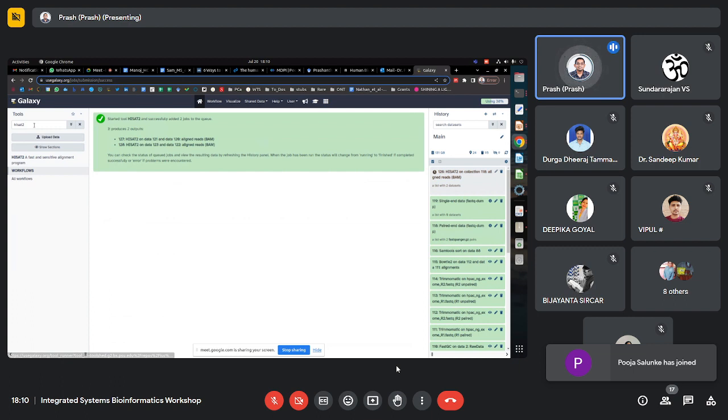Once it is run, you simply get the BAM file. It will take some time, and then you run SAMtools sort, and then SAMtools mpileup. Until sort that is fine; even mpileup is optional for RNA-seq, and then you run Cufflinks. So let me run this. It will take about 3 to 4 minutes. Otherwise we have to wait until tomorrow. It will finish, I'm sure. Although Galaxy is a bit slow, you can do this.